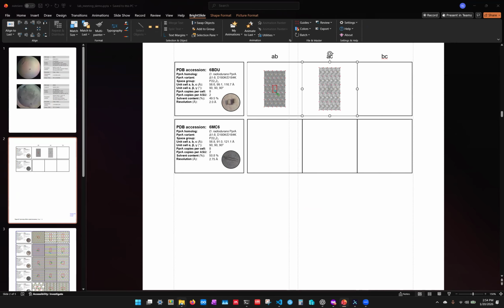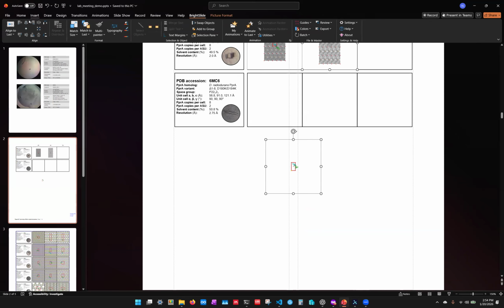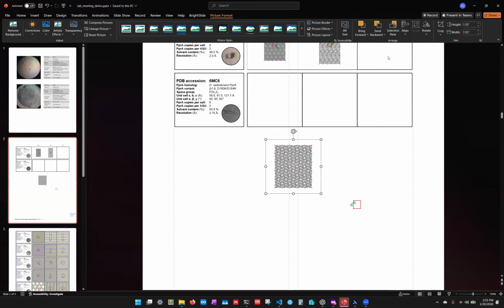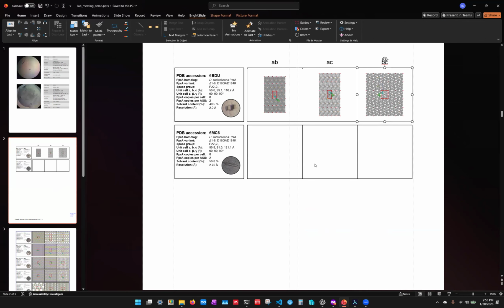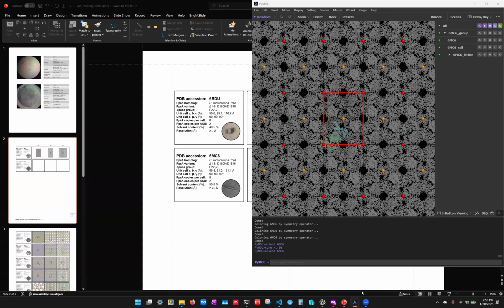It doesn't change any of the physical properties. It's like if you drew the points and defined them differently. So the real question is, is there a wrong or right answer? If you can refine it, it's not wrong. Okay. Alright, we're just going to do the same for the other one.